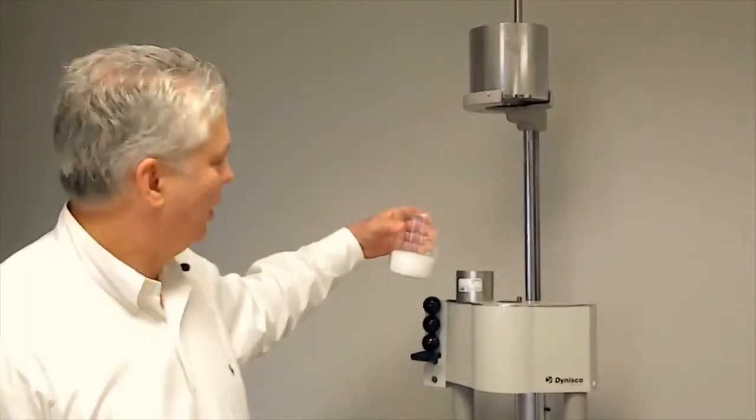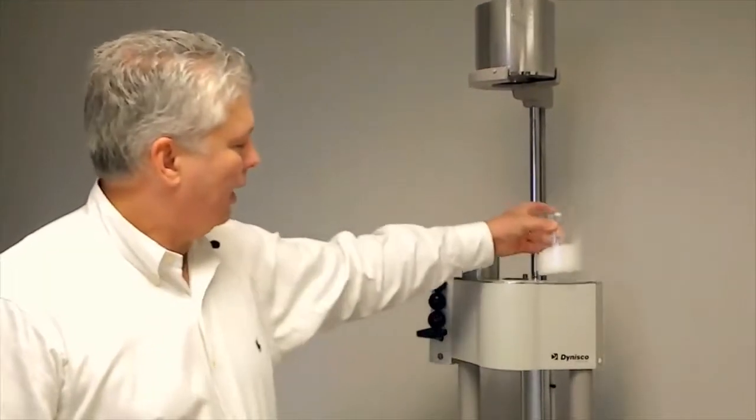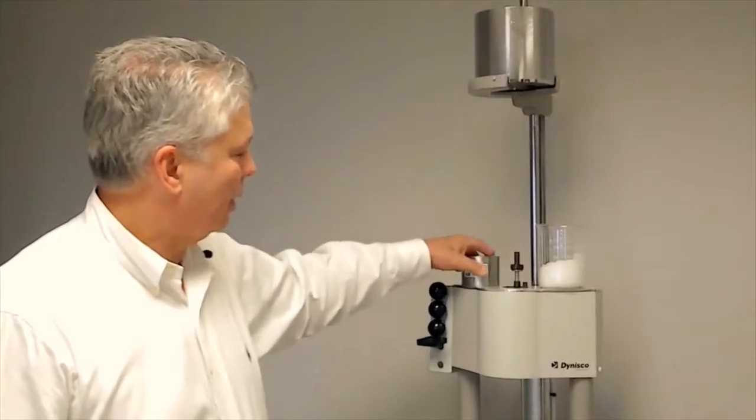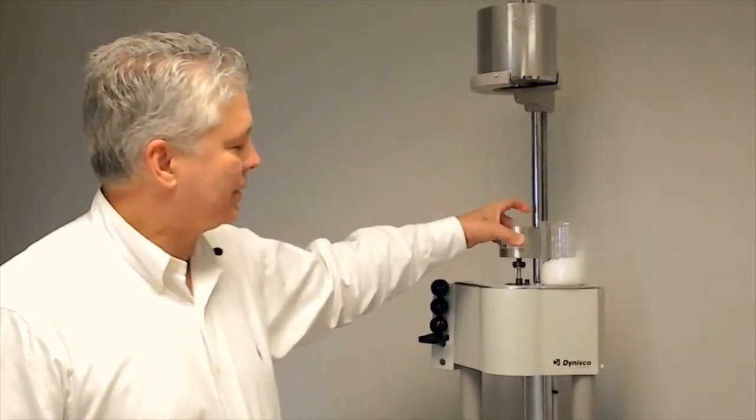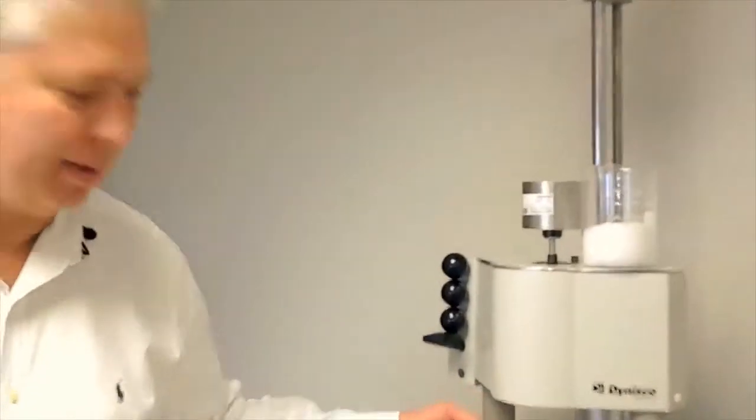It's 190°C, which you pour the resin into and then you put the weight on top. It's a 2.16 kg weight. Then you measure how much plastic comes out of this hole at the bottom. Can we get a tight on that?